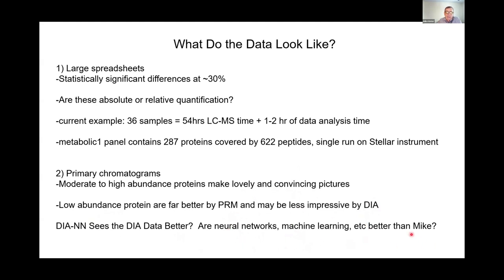And, you know, just a reminder that these things see data and see chromatograms better than us human beings and our eyes.